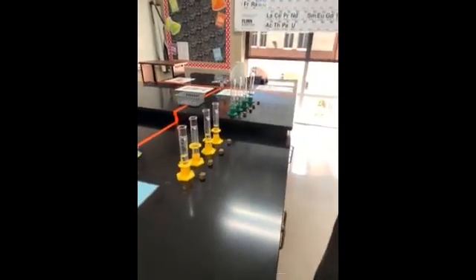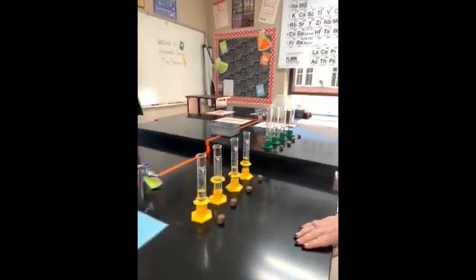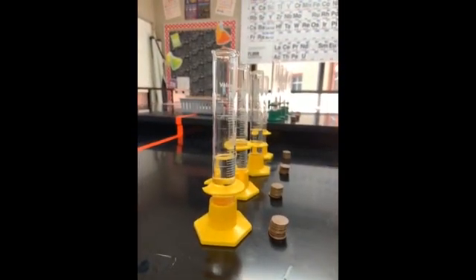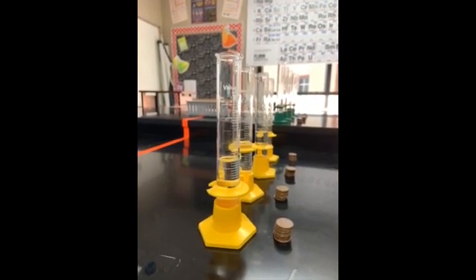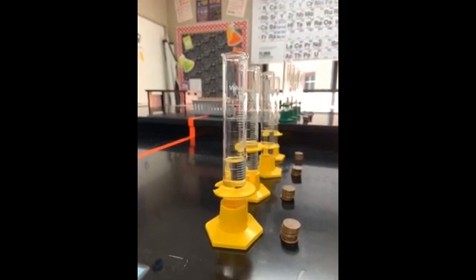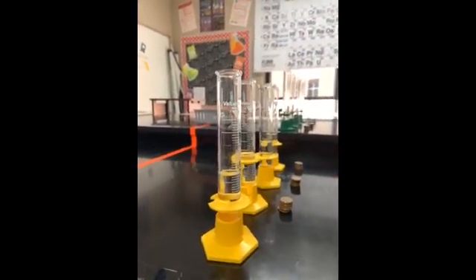Now we're going to do the volume data. So to get the volume of the pennies, we have to do water displacement. So for trial number 1 of pre-82 pennies, the volume of the water is at 25 point, what looks like 2, 4, looks like 25.60. So that is our volume of water for trial 1. I'm going to add the 10 pennies.